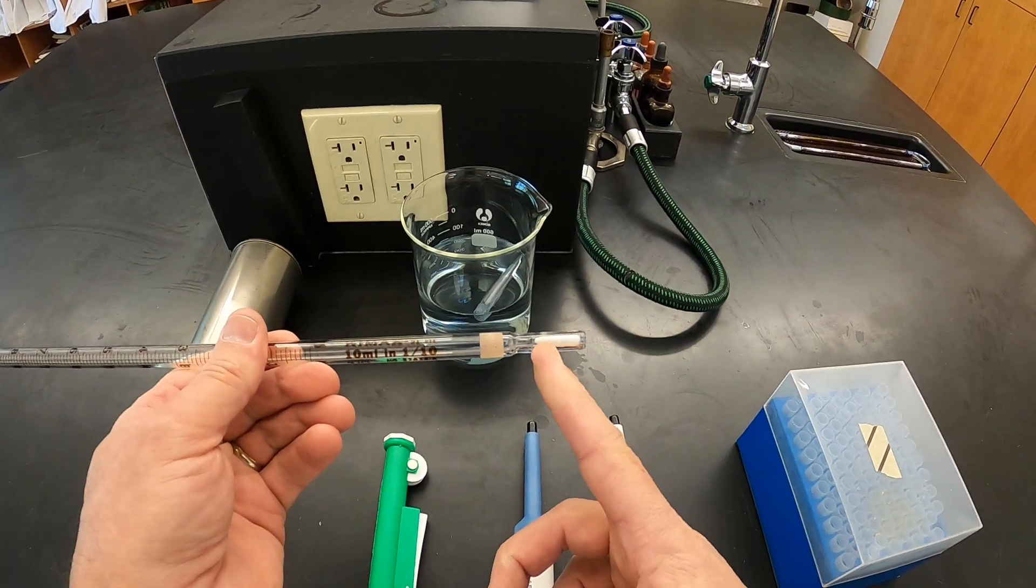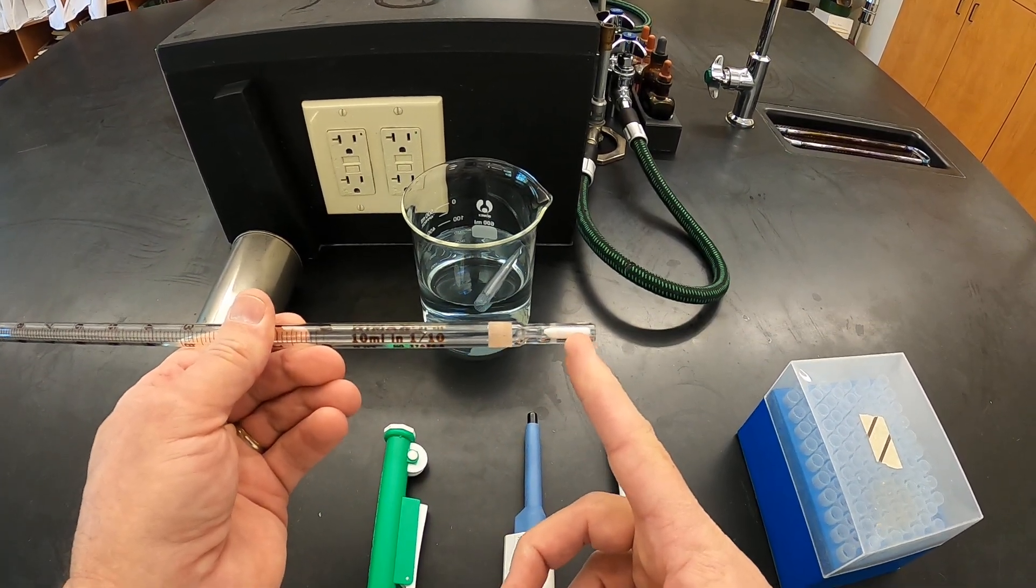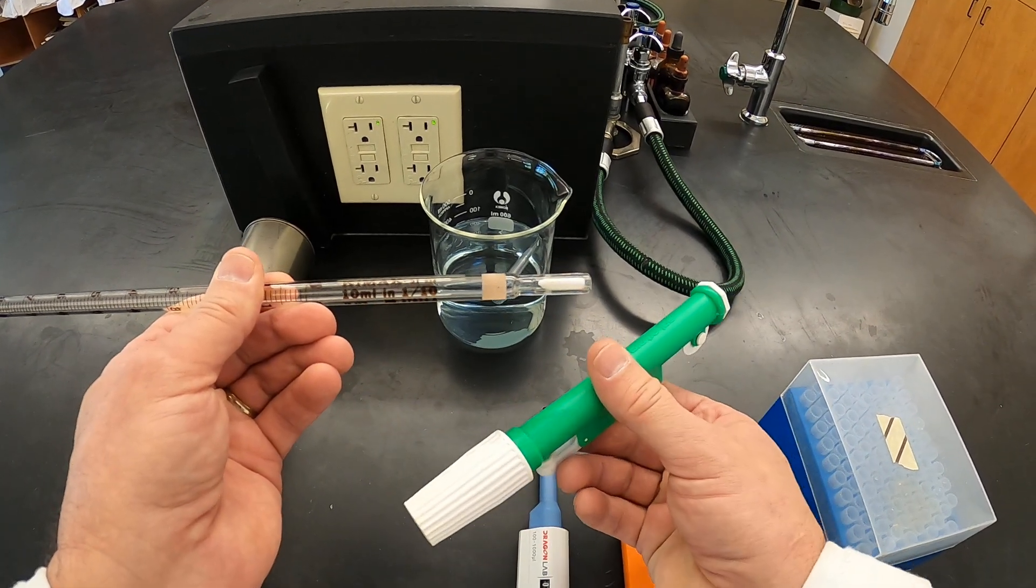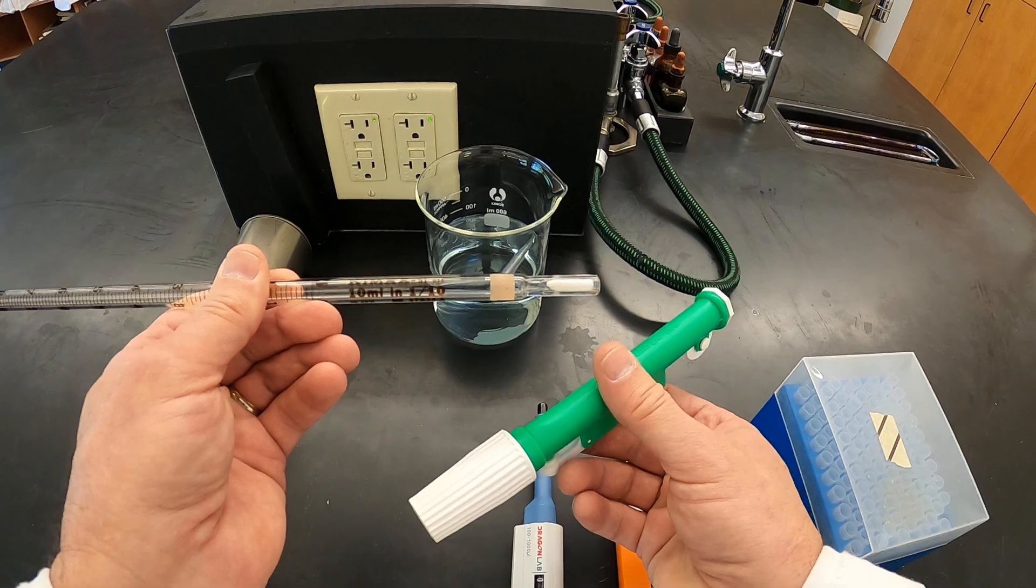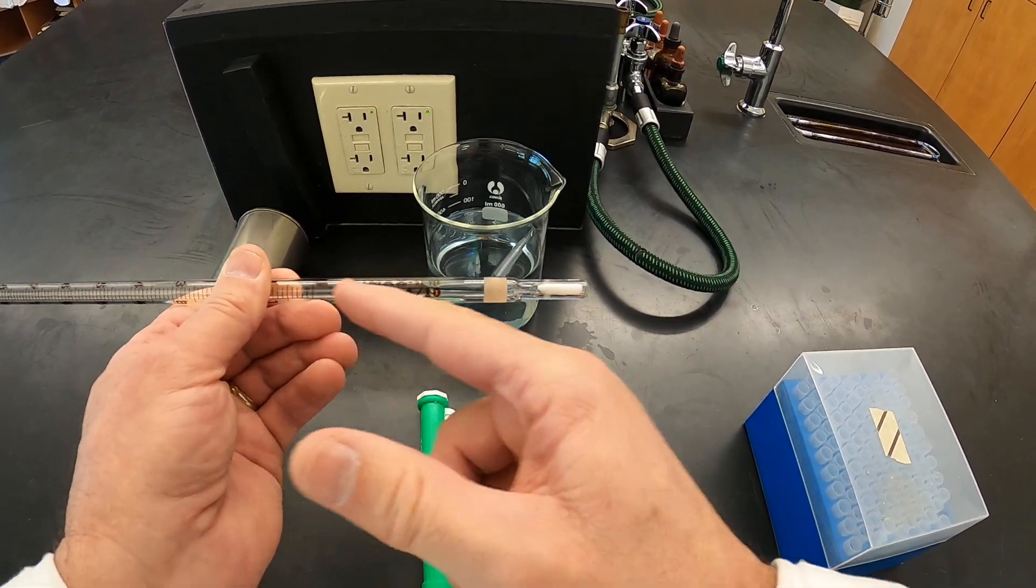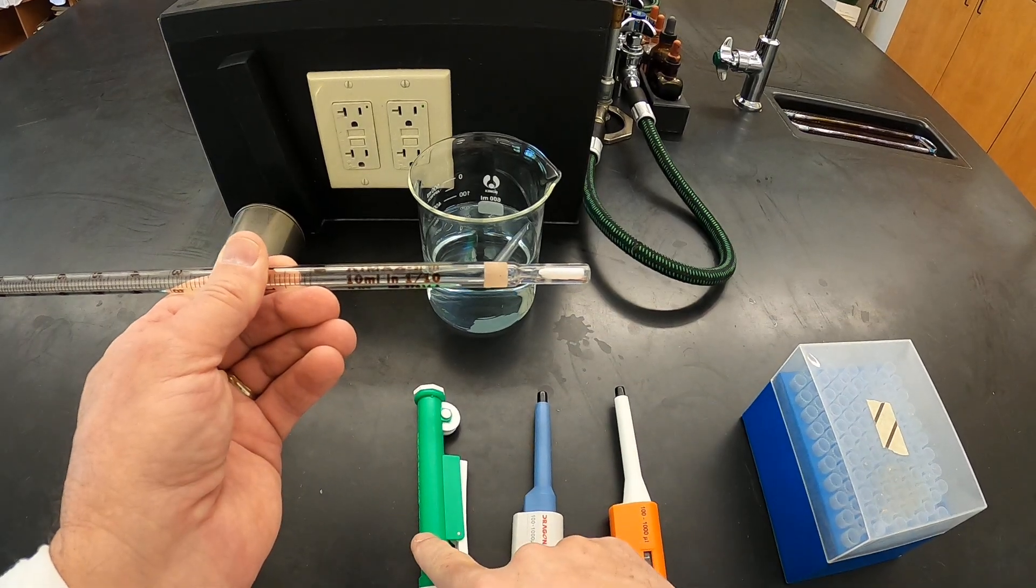You also notice right here at the top there is a piece of cotton that is used to protect the pipetting device, whichever one we're using, to prevent any liquid or bacteria from going up into the pipetting device itself.